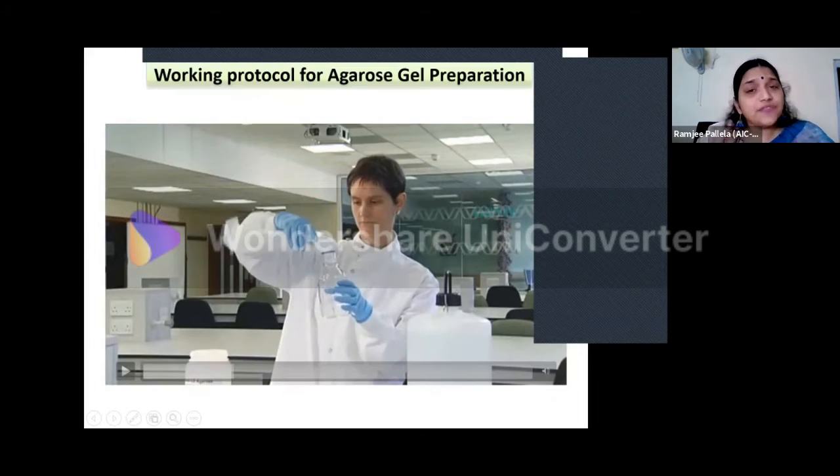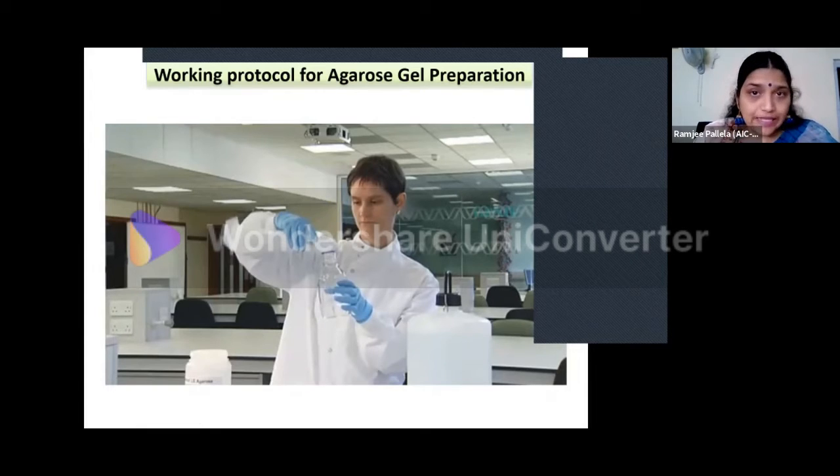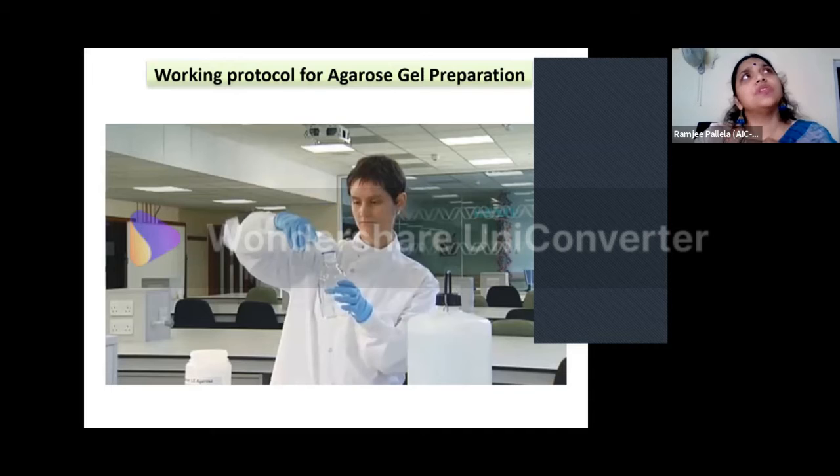Okay, so one thing that is very, very important for you is to always keep your notebook ready. Whenever you're doing any experiment, this is the way I have been working all these years. It is almost around 18 years now that I'm in research. So this is the regular practice. You always keep your notebook ready with you.